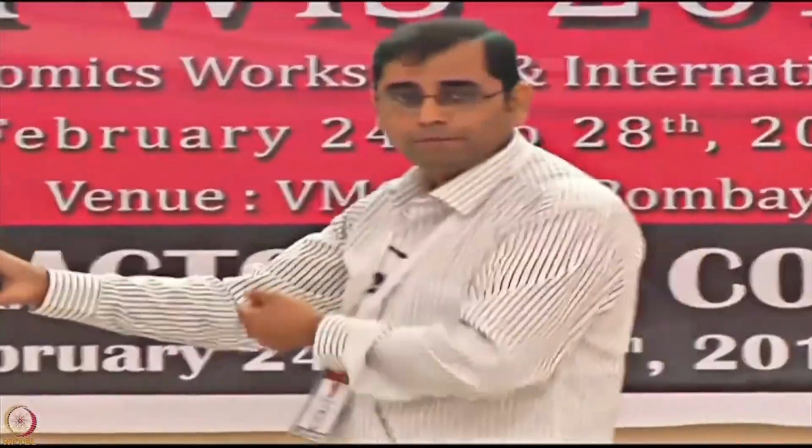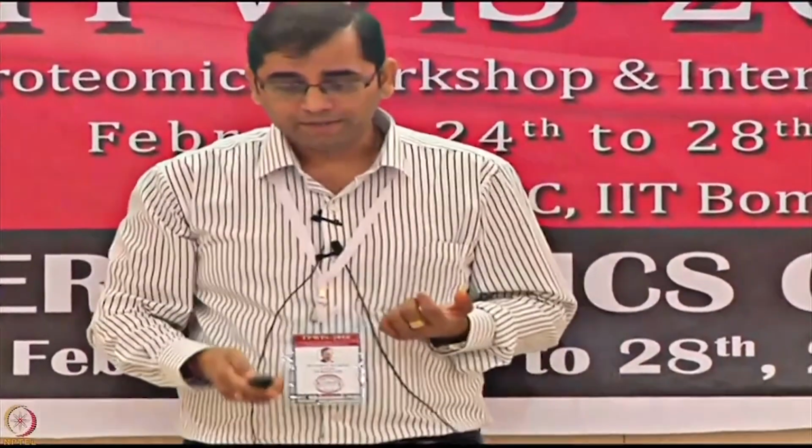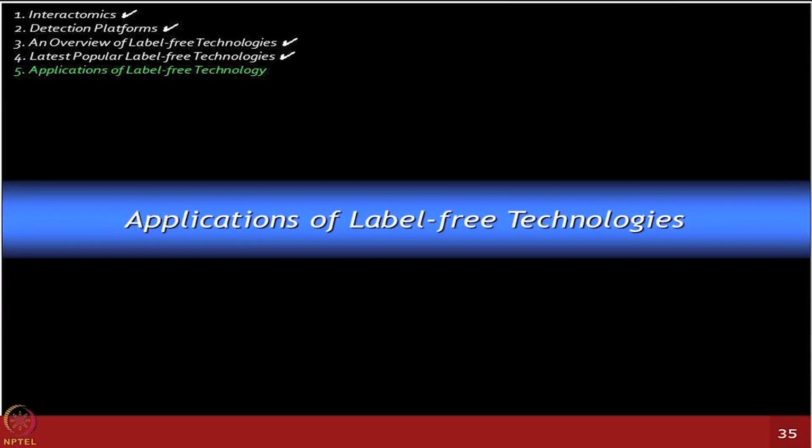Now you can use probably Biacore to test how many of those you now want to measure the exact on rate and off rate for, right? Okay, so there are many label free platforms which are possible. I am restricting the applications right now mainly to SPR, because that's what we currently have available at IIT Bombay.